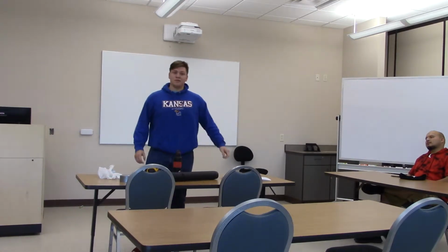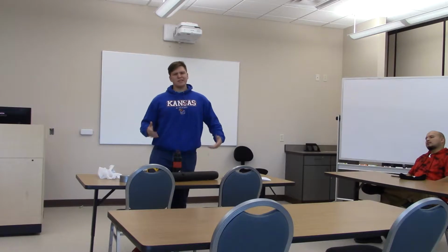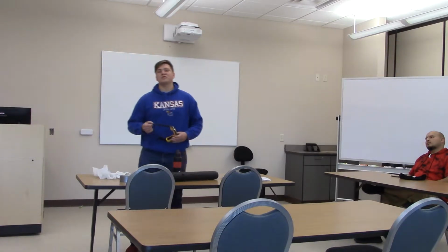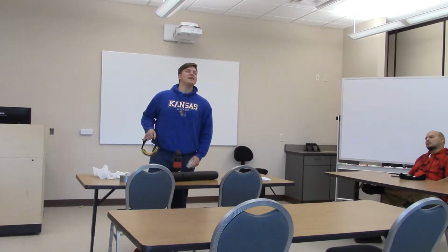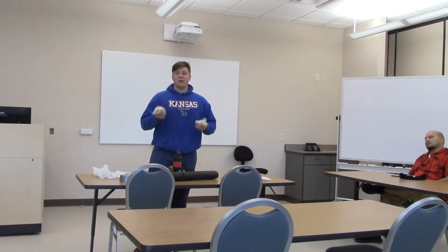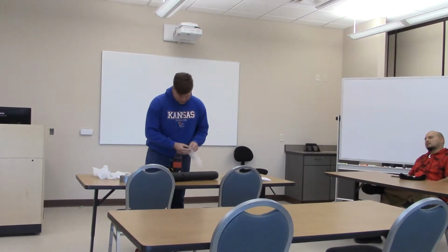I know a lot about chemicals. I'm, I guess, a wannabe chemist, right? So what we're going to do is discuss all sorts of safety procedures, starting with PPE, which stands for personal protective equipment, such as your plastic gloves and your goggles.